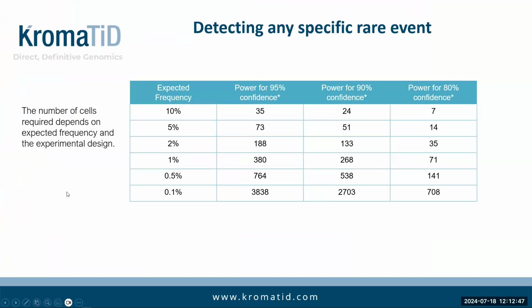And that moves us on to this next aspect, which falls out of the comparison report. So statistically relevant, at what level do you want to or need to see this information? So since we are breaking it down to a specific event comparison level, you can use these numbers around confidence intervals to decide, with other data that you have, on a level of analysis.